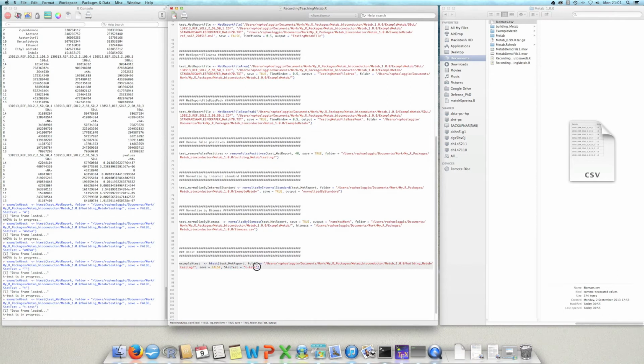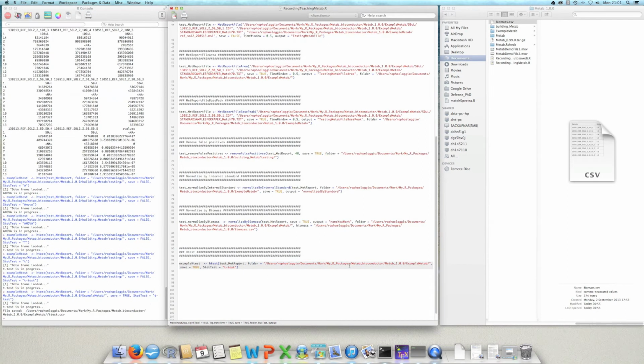And if you want to save the results, the same idea. Let's say that we are not going to put an output for now, I want to save. Let's see what's the default value that it's going to define. The folder used will be the same folder that we used in the function to normalize the biomass. I want to save the results exactly in the same folder. So it's in here, and then I apply.